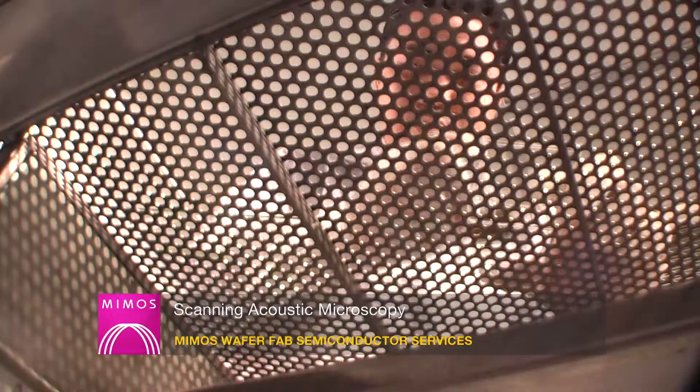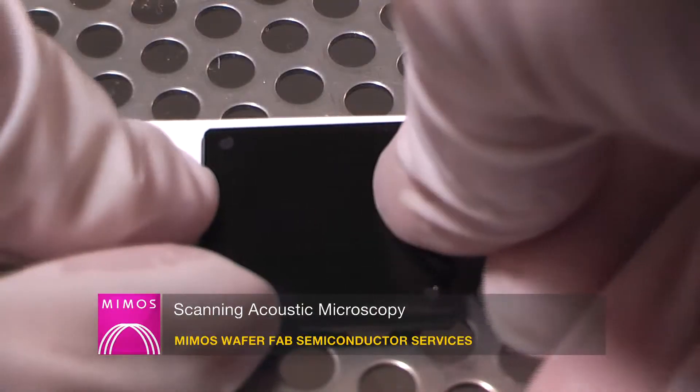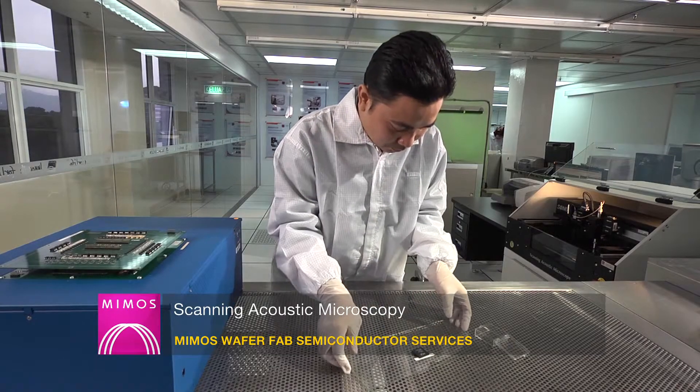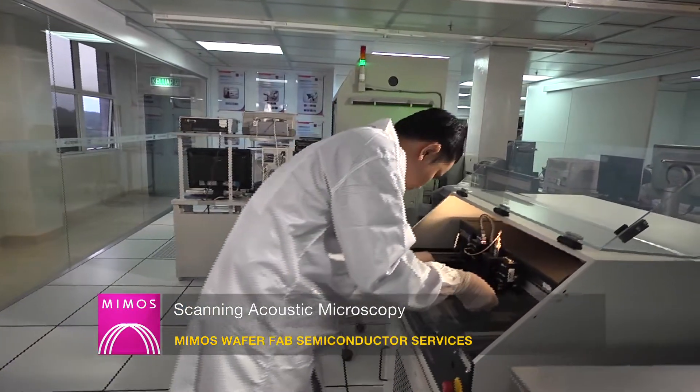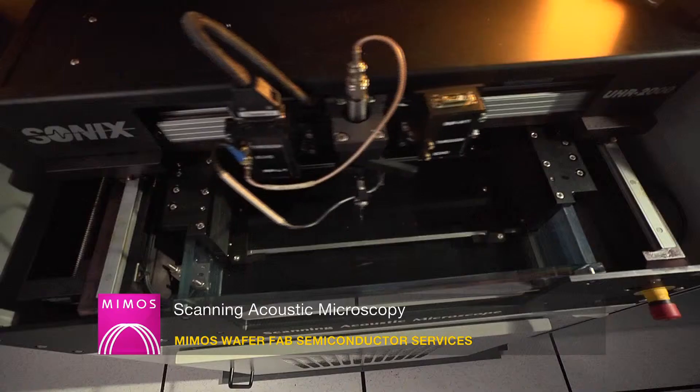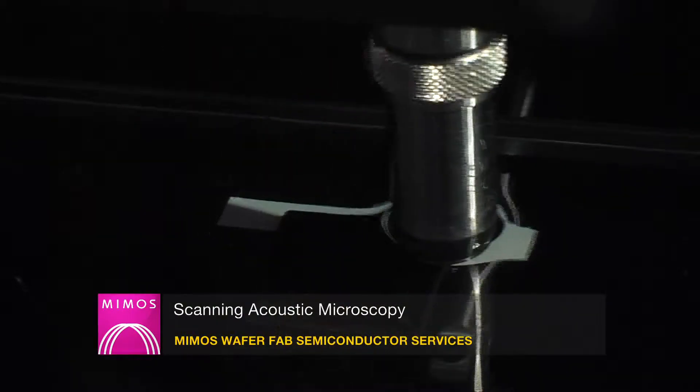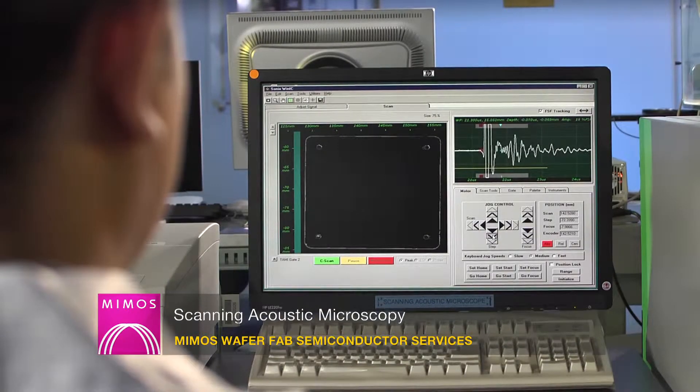Scanning acoustic microscopy is used to locate internal discontinuities in semiconductor packages. It is a useful tool for studying die-attached integrity, sealant integrity and molding adhesion quality.